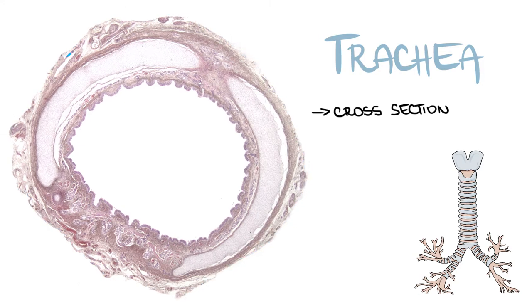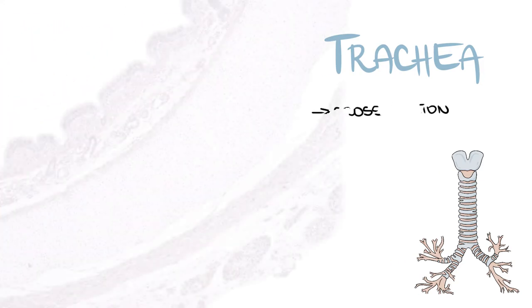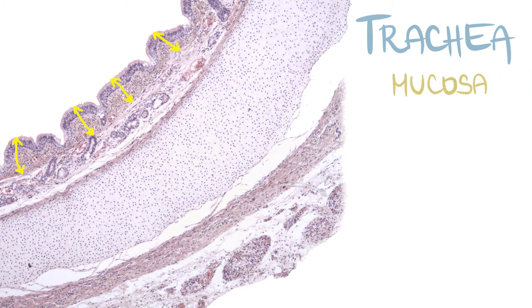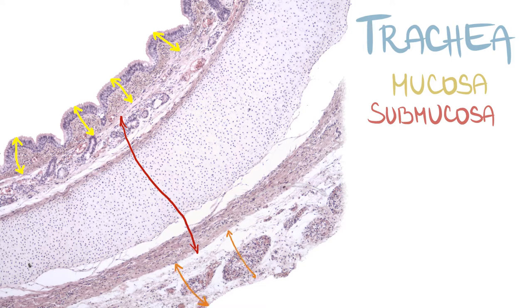We can distinguish some basic layers. There is a mucosa close to the lumen, with submucosa underneath. And then the outermost layer is adventitia.